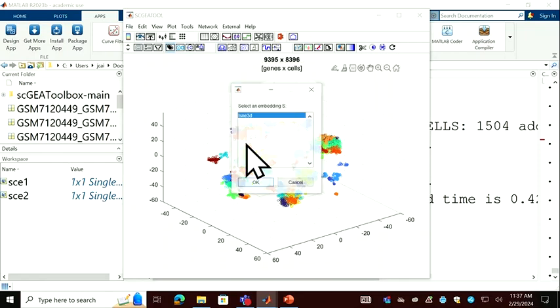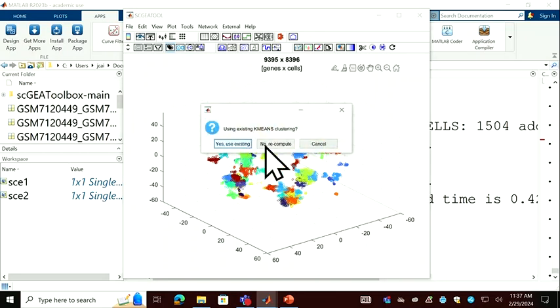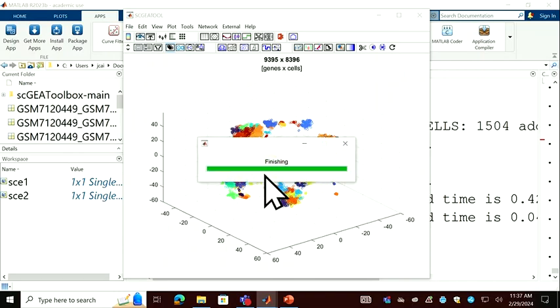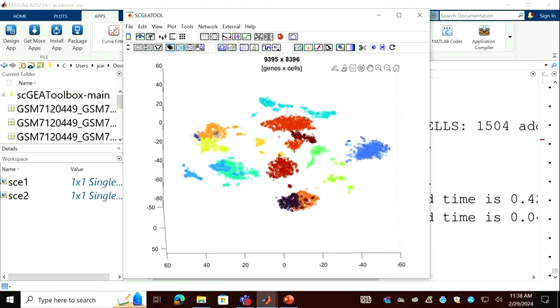Yeah, let's try. I'm going to use a smaller number of clusters. I will recompute to put this into 15 different clusters because I want to do this manual selection. I don't want to have 80 different selections. But if you use 80, then it allows the automatic annotation. That's pretty good. But now I want to show you the manual annotation for each individual cluster. So I want to run this annotation 15 times. So I group them into 15 groups.